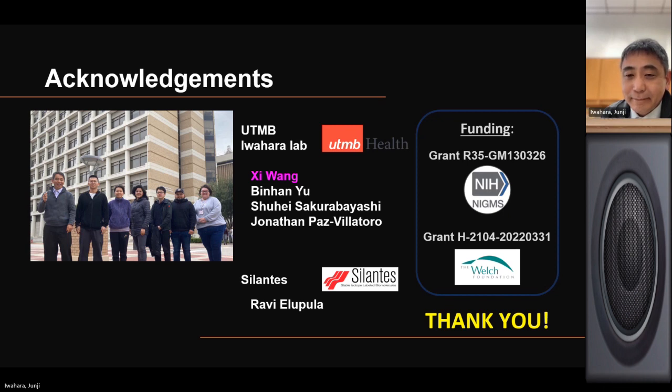All right, that's a really interesting method, and thank you for publishing it. I do have a few questions. Your reaction time is 90 minutes. If I ran it for 2 hours or 3 hours, would I get more DNA, or is that just the lifespan of the enzyme? Okay, that's a great question, and we actually worked on that.